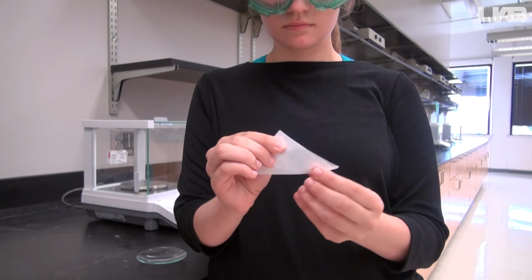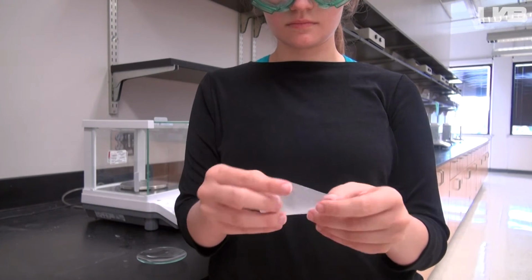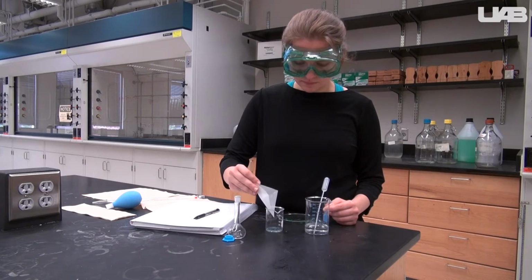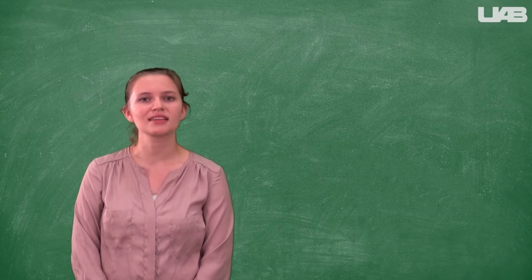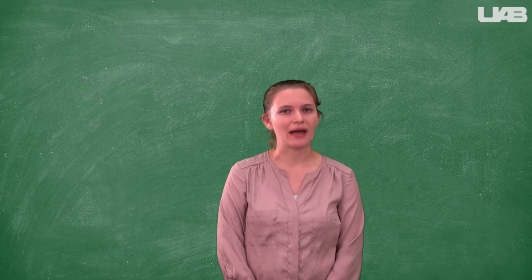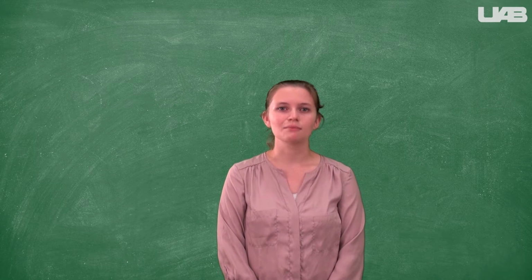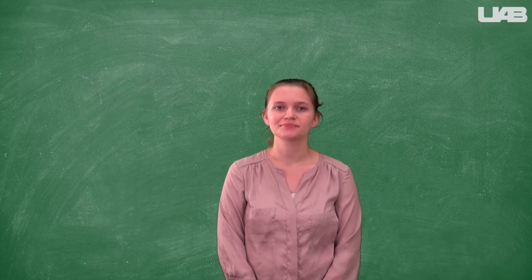Fold it from corner to corner like this so that it forms a spout that you can use when pouring it into the flask. Make sure all the crystals make it into the flask. If some crystals don't make it into the volumetric flask, you need to start over. The copper salt can damage the balance, so if you spill any of the crystal onto the lab bench or balance, make sure you clean it up or participation points will be deducted.